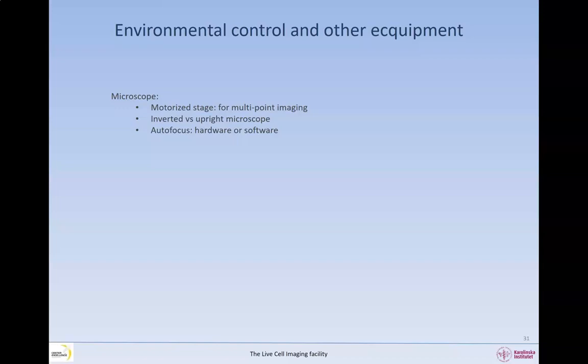However, in experiments that last longer than a few minutes, this will likely not be enough. Thus, using an autofocus system is a must. You can use either a hardware autofocus that relies on detecting a reflection of a near-infrared light beam from the interface between the coverslip glass and imaging medium, and use drift of this reflection as feedback for the motorized focus drive. Another option is software autofocus.